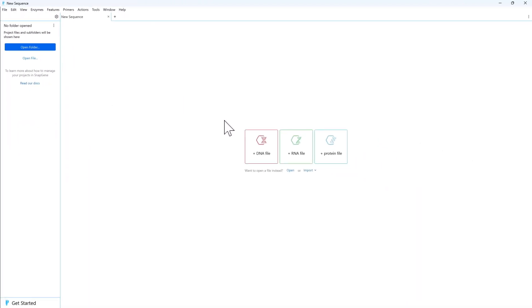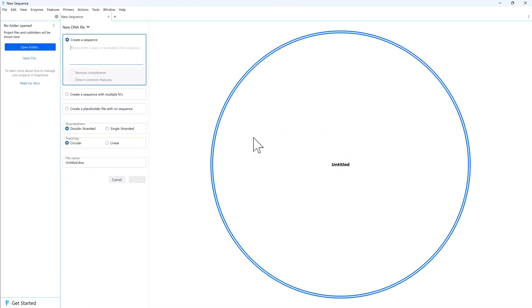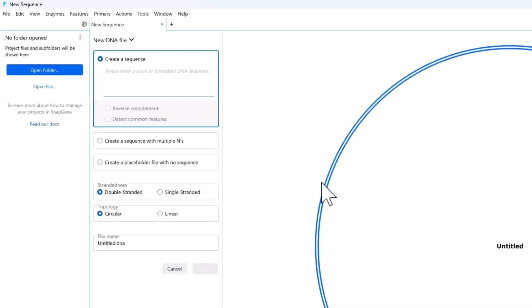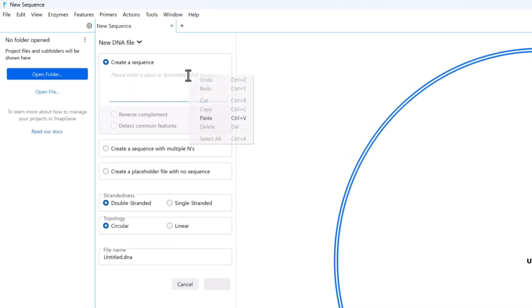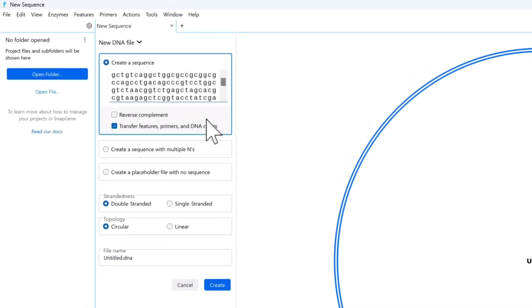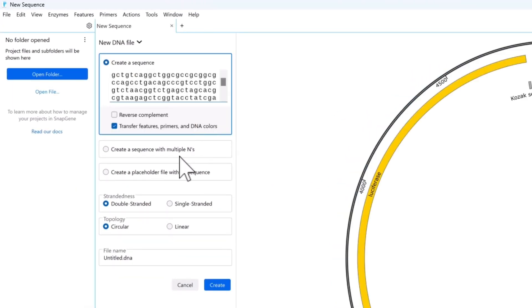For example, select Create a new DNA file, then simply type or paste a sequence into the text field and choose whether it is single-stranded, double-stranded, linear, or circular.